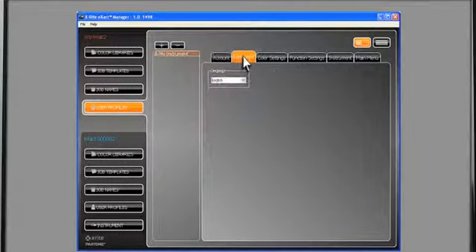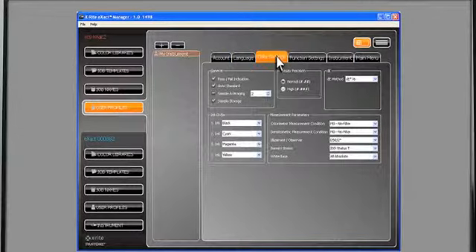Under the Language tab, you can change the language for this account that will appear on your instrument. The Color Settings tab will allow you to set the default color settings for the selected user. Under the General Settings, you will be able to enable a pass-fail indication, as well as the ability to automatically select the closest standard for a sample and average measurement values of samples.